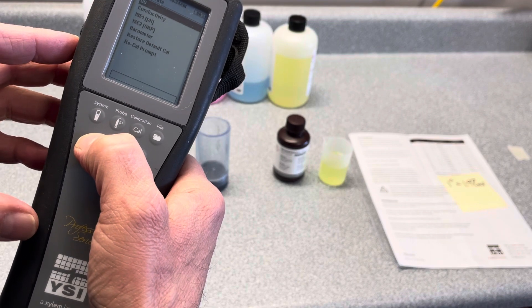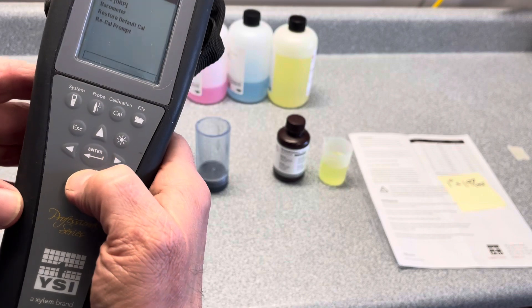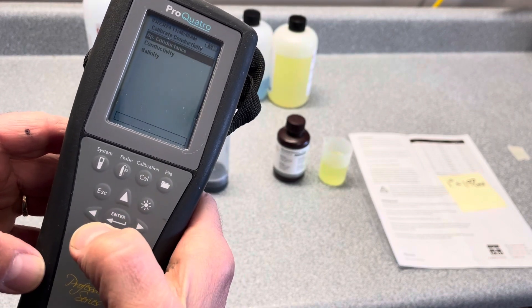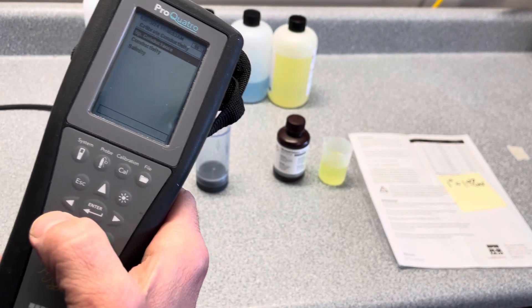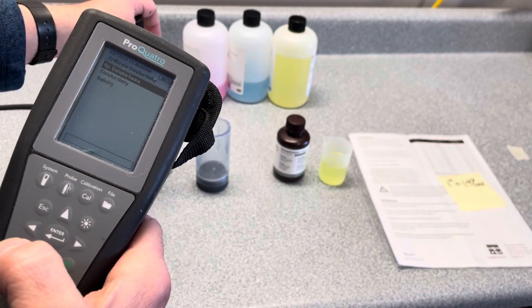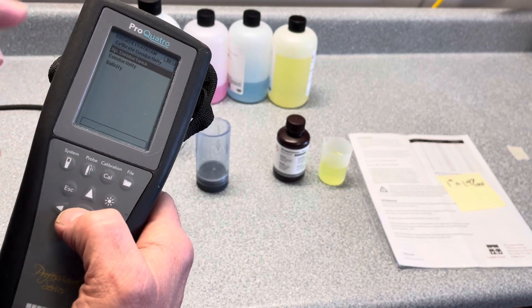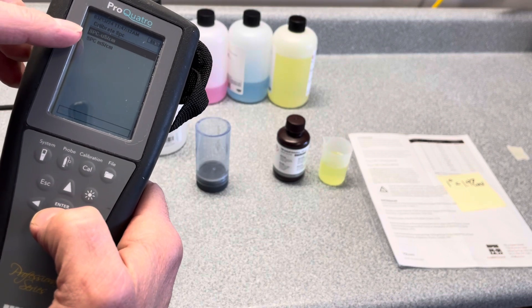At that point it goes back to the calibrate screen. The next parameter on our probe is conductivity. Go down to conductivity and hit enter. For what we're doing, we're going to use specific conductance — we don't have to worry about temperature at that point. We would pour our conductivity standard; in our situation we're going to use 1000. We're going to calibrate in specific conductance and select the first one that matches our bottle.